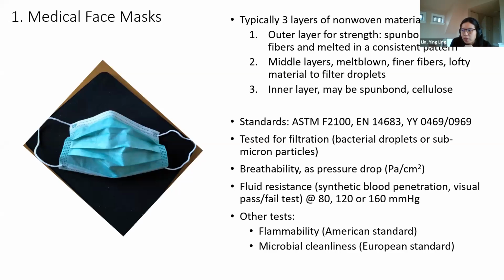There are very well-established American standards, European standards, and now because of supply, you might encounter the standard from China. So it's the YY. There's also a T sometimes, so for simplicity, the numbers are what are more informative. So 469 is a surgical mask. So this means that it's fluid resistant. It's tested for fluid resistance. And 969 is non-fluid resistant. So there is the same parallel standard within the American and European standards.